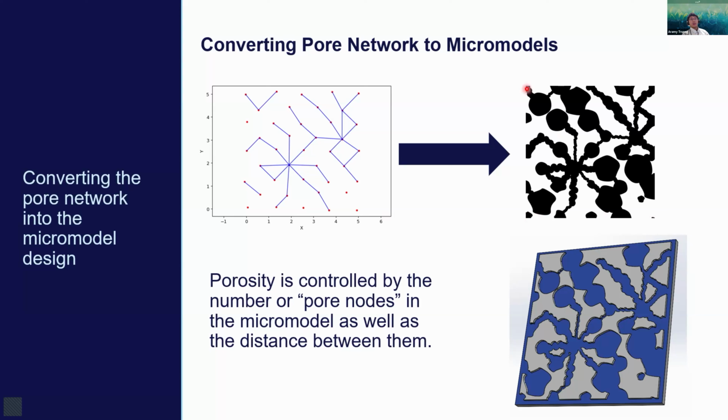So let's say this image is, I say pixels in air quotes, 50 by 50 pixels. If I increase this to 100 by 100 pixels and keep the number of pores the same, the structure will be the same, but now the distance between each pore is going to be enlarged. So there will be less porosity in that case.